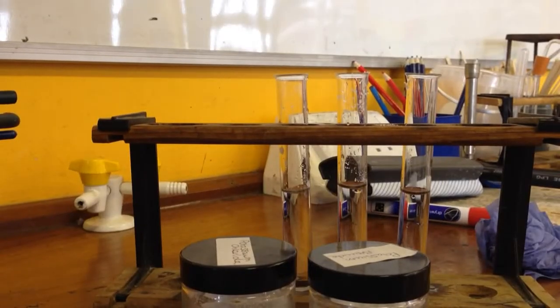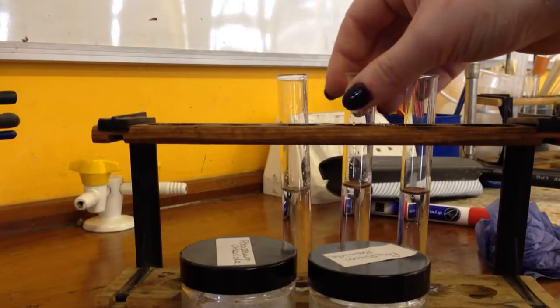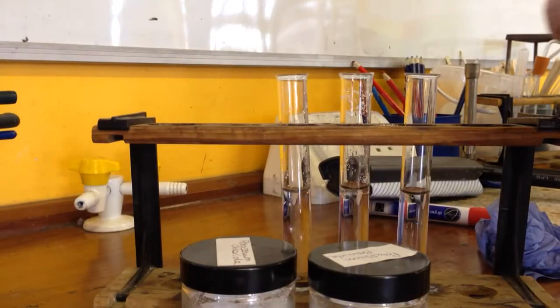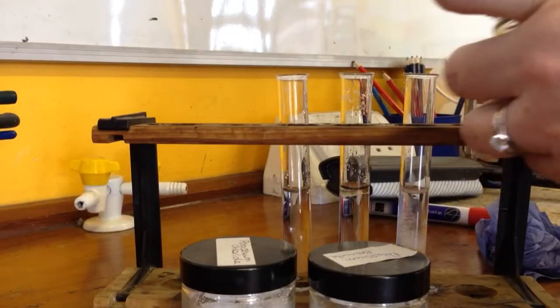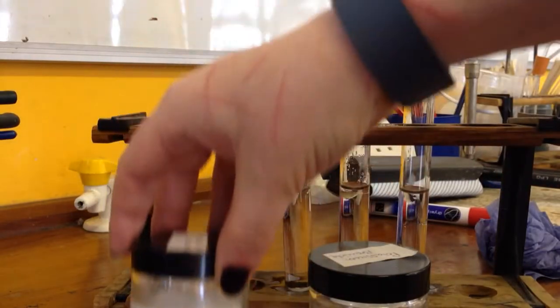So here we are testing for halide ions. I've got some test tubes for water and into the bottom of these I'm just putting a spatula full of the potassium salt for each of them.